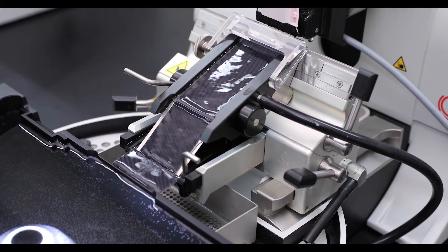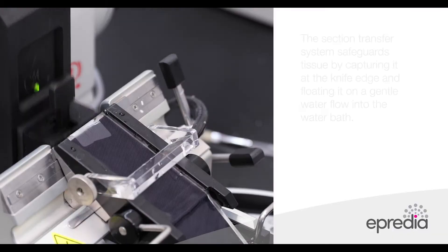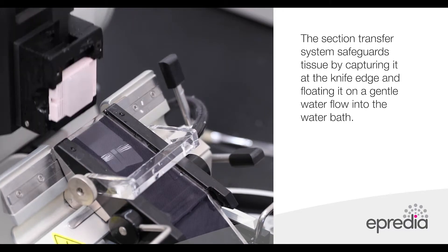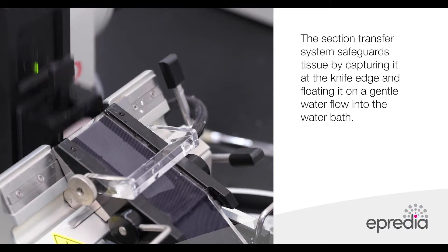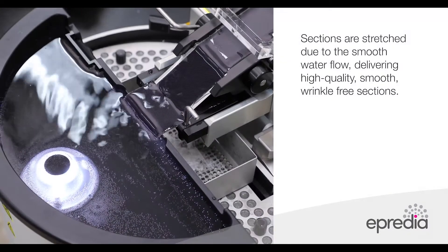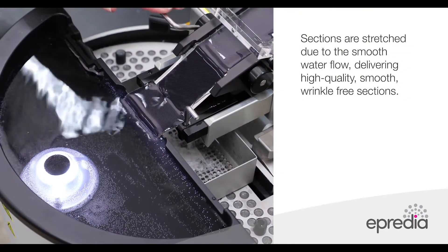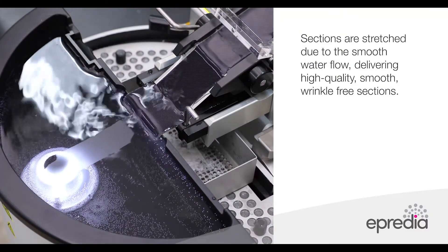The section transfer system safeguards tissue by capturing it at the knife edge and floating it on a gentle water flow into the water bath. Sections are stretched due to the smooth water flow, delivering high quality, smooth, wrinkle-free sections.